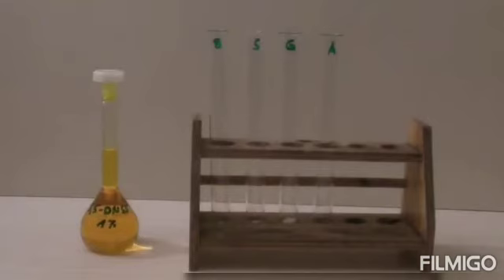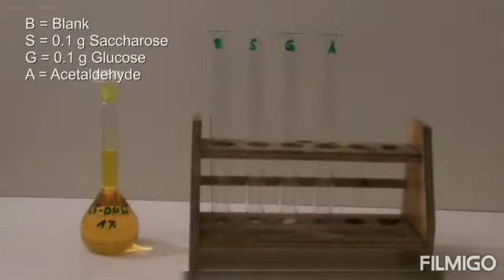Then here we have taken the test tubes. First is for blank, second test tube is for 0.1 gram saccharose, third one is for 0.1 gram glucose, and the last one, that is A, is for acetaldehyde.